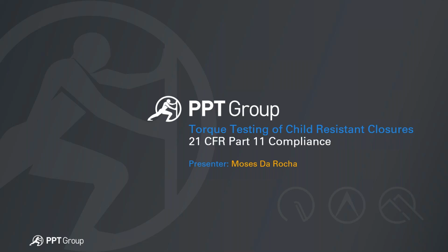As the delivery gods would have it, the ideal test that we would have used for this webinar did not make it as far as delivery. We did not receive it in time. The software that drives that test is essentially the software that is indeed 21 CFR Part 11 compliant. However, the tester design, footprint, and form factor are all very similar to the test that we will be using today, more as a proof of concept, and then we'll take a closer look at what a typical test would look like in the compliant software.